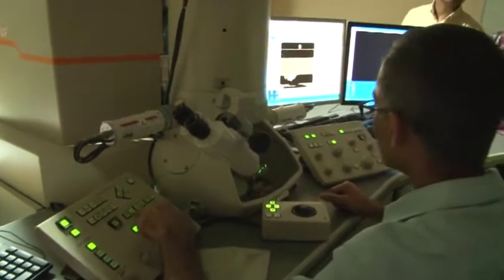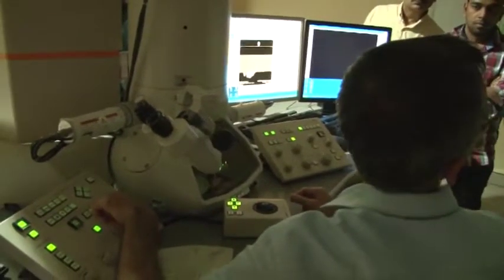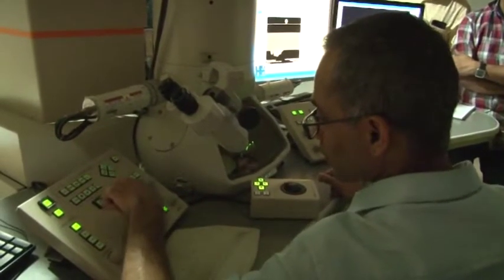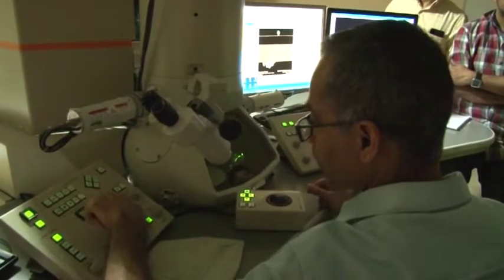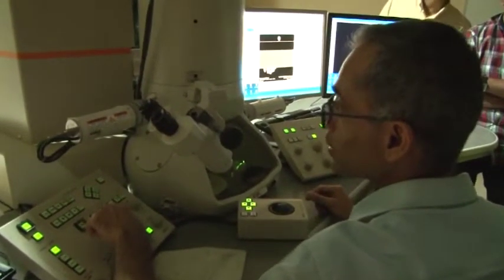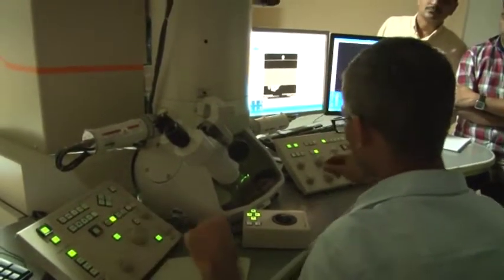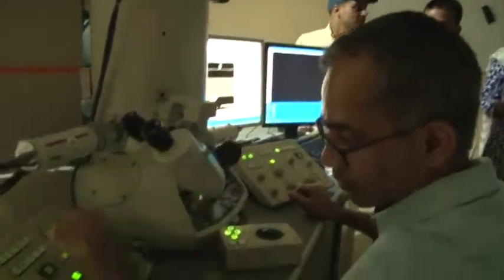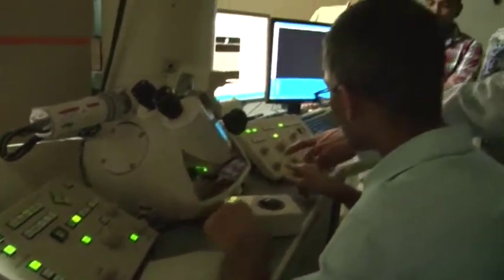So shifting the diffraction pattern would be with PLA, is it? Is it not the deflection coils? I think it's PLA. Yeah, just try. It should be. And then it should be shift, or it should be this one.